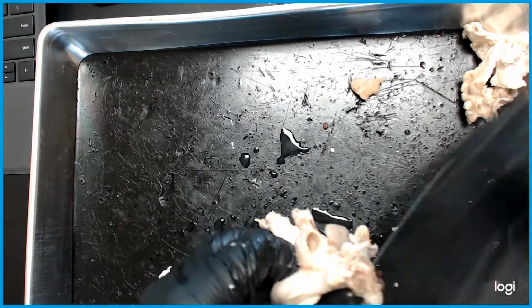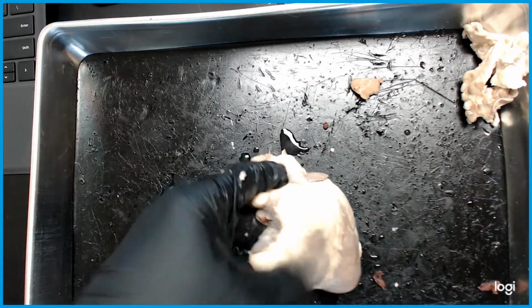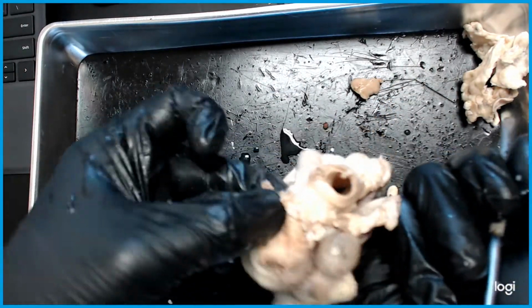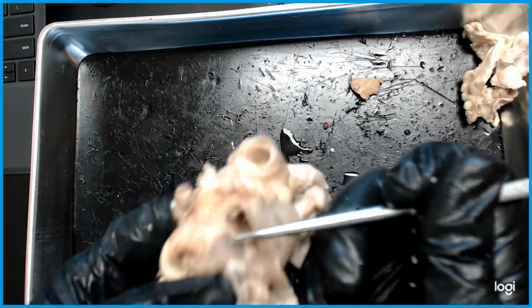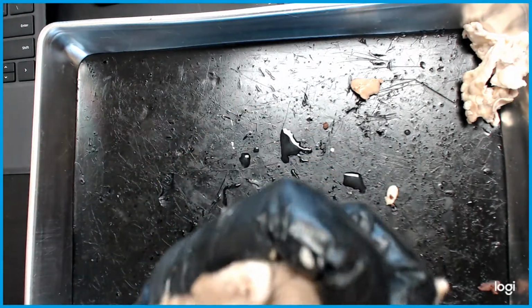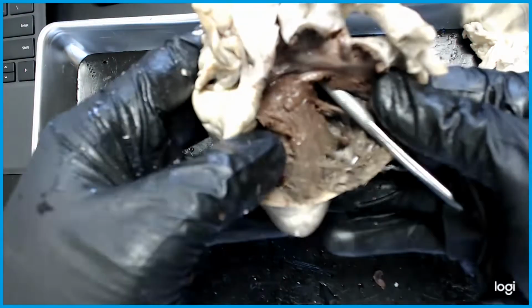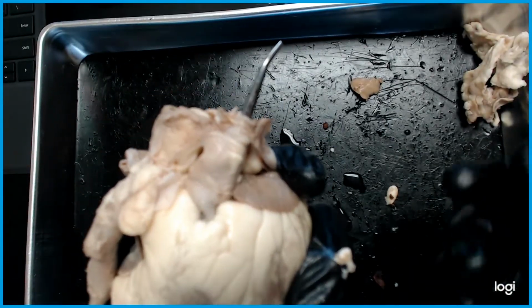If I continue following it through, let's see where it leads. Let's try the probe following through where we had our finger. So we place our finger back in there. Let's see if we can find it. So remember, that's where I had my finger. I continue going. There it is. I have now connected the right ventricle all the way through the pulmonary trunk, which is the pulmonary artery, or the common pulmonary artery.